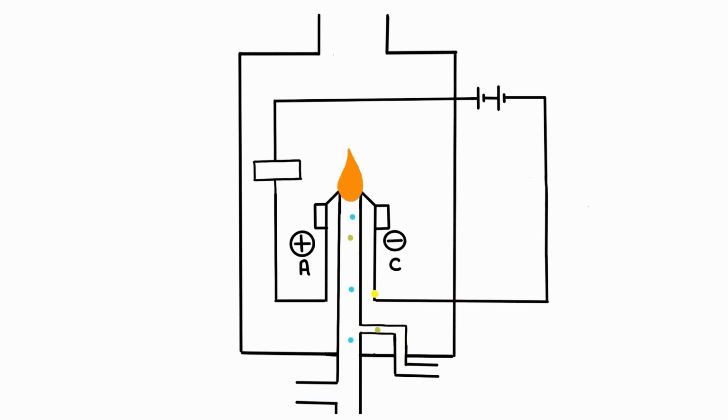Now let's understand how FID detects and quantifies our analyte. There is an inlet at the bottom here, which introduces the contents of the column into the detector. Let's say we have a carrier gas coming in from the column and entering the detector. This carrier gas is an inert gas, which is why when it enters the flame, it does not get ionized. It heats up and exits the detector from up top. Eventually, an analyte enters alongside the carrier gas.